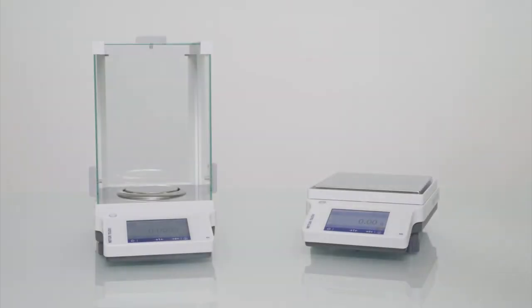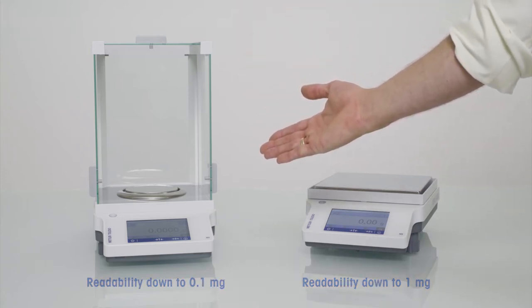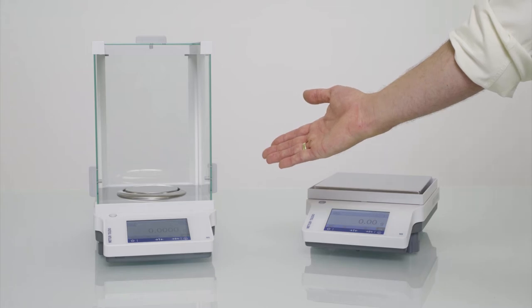The balance on the right side is an example of a precision balance. Precision balances have readabilities of down to 1 mg. On the left side you can see a MET analytical balance. Analytical MET balances have a readability of down to 0.1 mg.